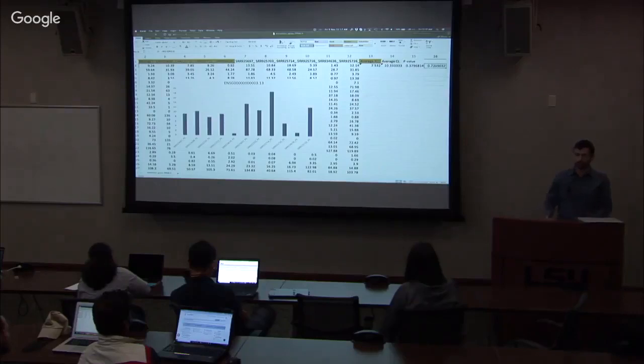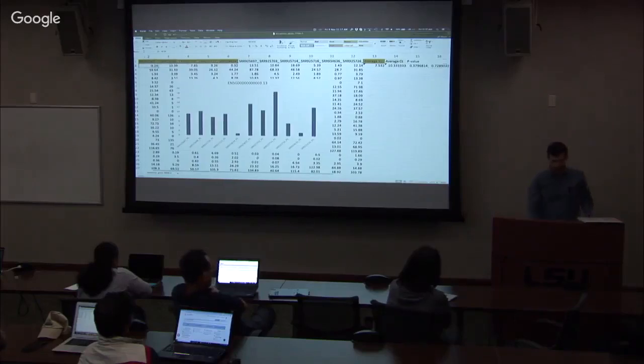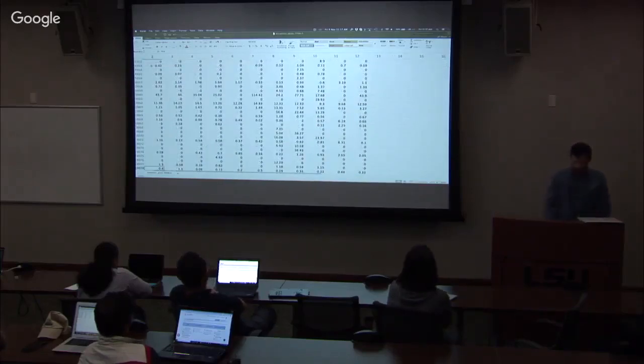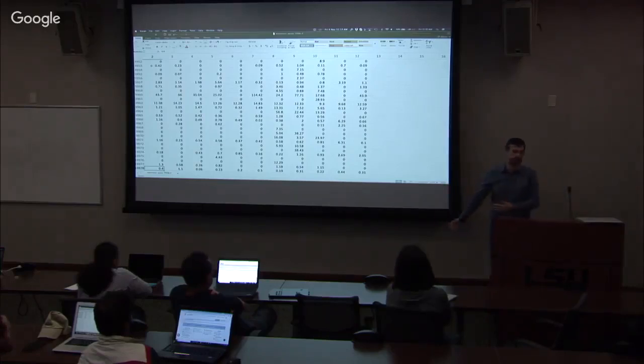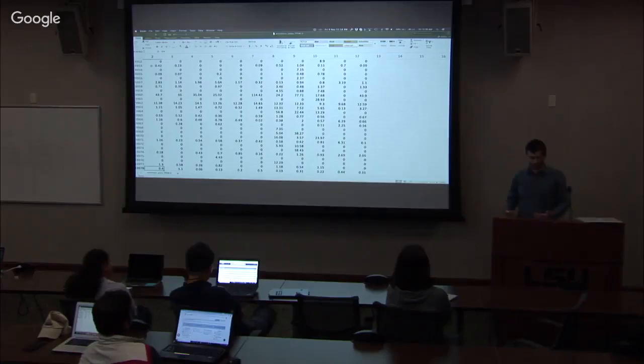So now the problem is, let's say I can do all of this in Excel. So why do I need to do differential gene expression? Well, one of the problems is that I just have a lot of genes. Let's take a look at how many I have. I have close to 20,000 genes, right? So I can go 1, 2, and maybe select number 500. But at the end, I have a lot of genes that I have to deal with. And then I have to select those genes that have a good p-value and a high enough fold change that I can actually say that they are differentially expressed, and I can try and interpret that difference.